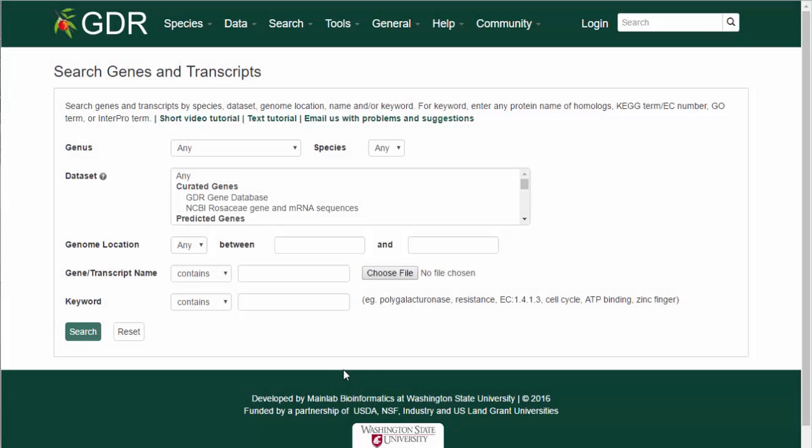In the final example, for datasets with annotations, a keyword search for the GO term, BLAST, KEGG, or INTERPRO results can be done.